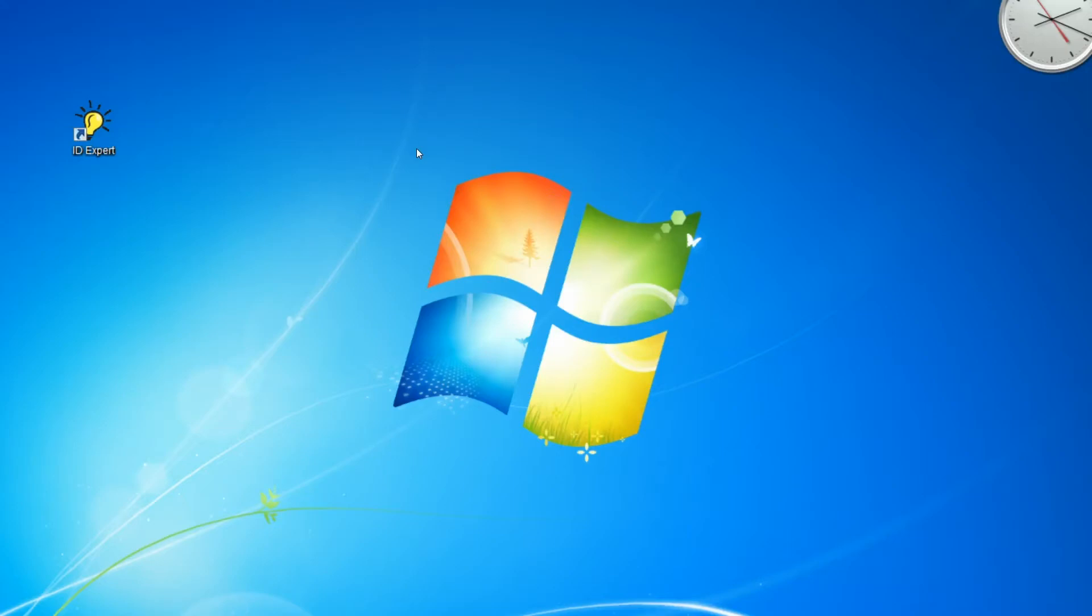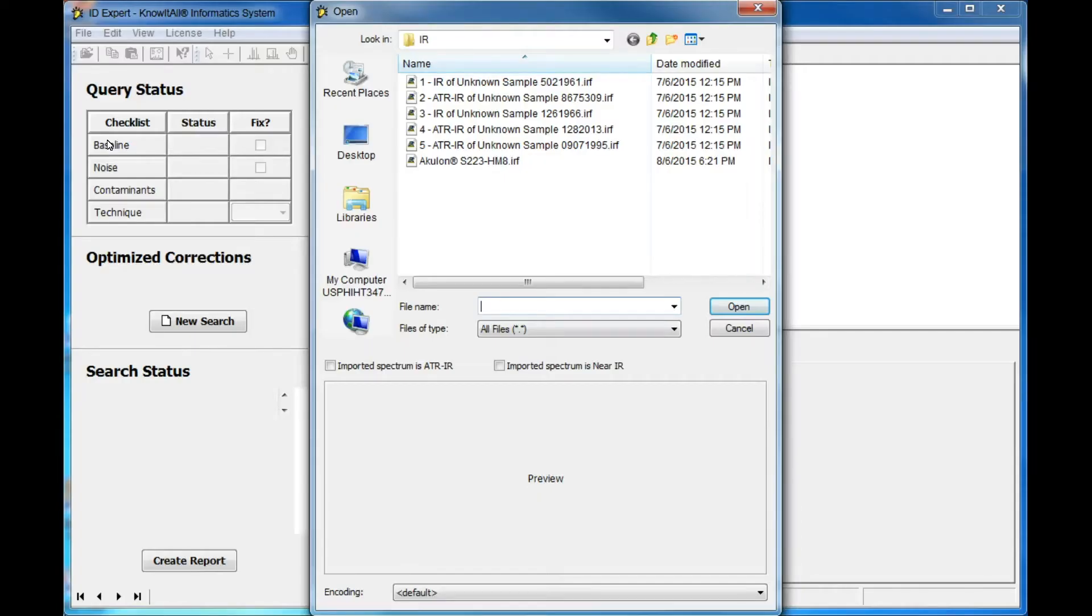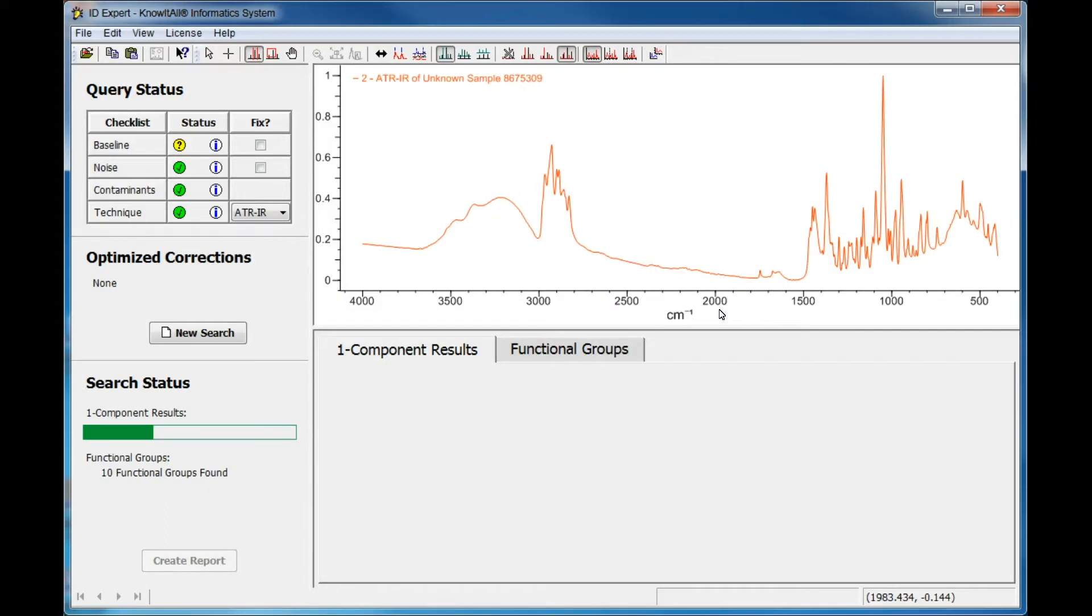Now we'll show you how it works. Let's begin. Open your unknown spectrum and the analysis begins automatically. Know-It-All has identified a problem with the query spectrum's baseline and suggests we fix it.